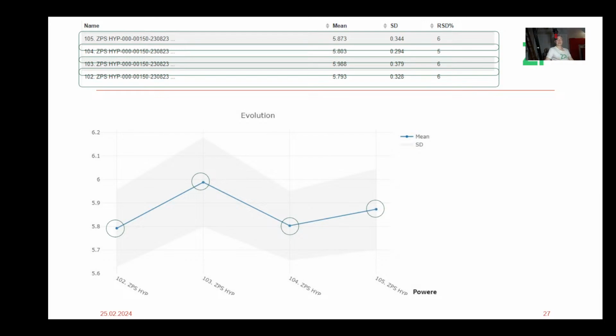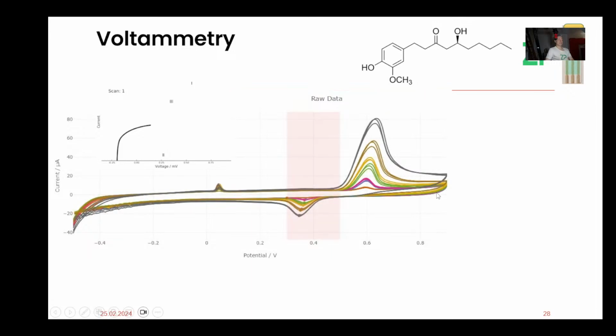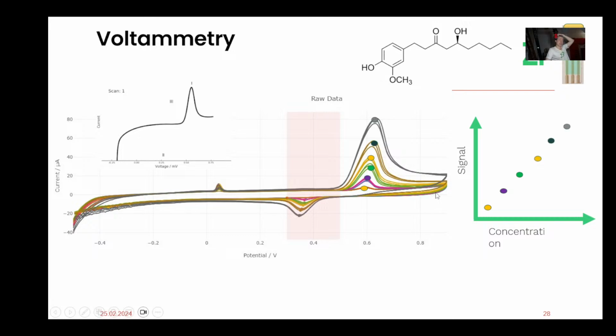And when I say a good assay, I mean good signal versus concentration. If you come to one of our webinars, in fact, this is one of our examples, where we're looking at different concentrations and we're looking at the peak height. It's done in triplicate at each concentration. You can see a really nice tightness in data. By that, I just mean that, for the highest concentration, you can see the three curves, therefore the three peaks, but there's not this large relative standard deviation between all of them.